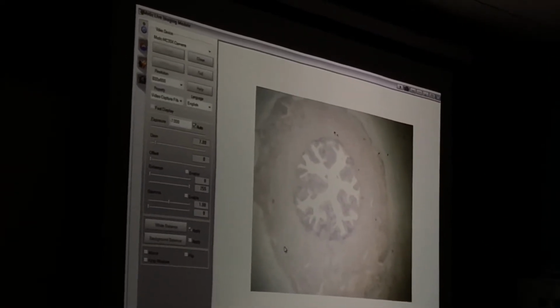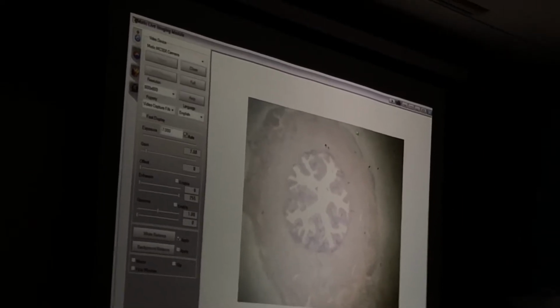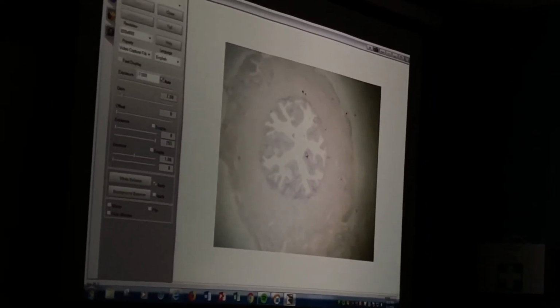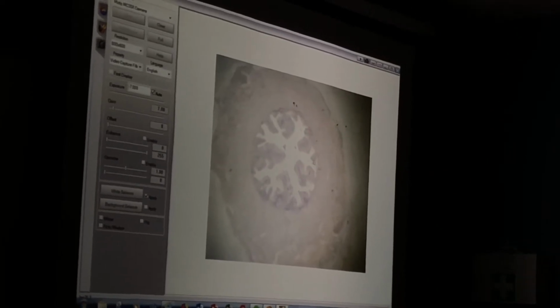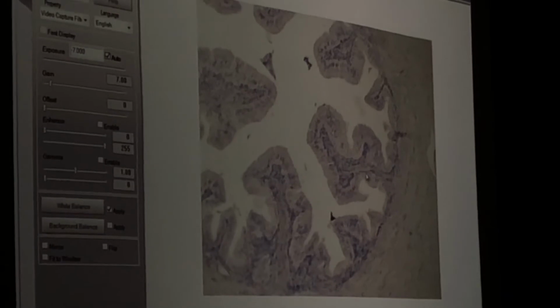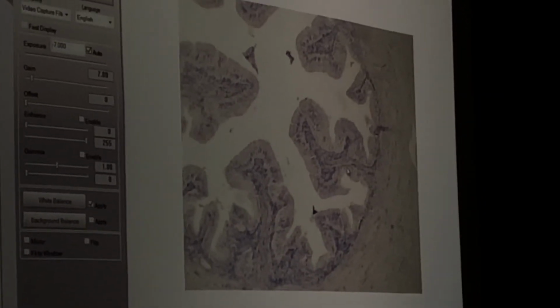What else do I see though? Smooth muscle. I see a lot of smooth muscle. Folds. Yeah, what are these called? Mucosal folds. Did anybody else have mucosal folds? No. So you want to make sure that you can tell a mucosal fold from a rugae, right? But when you bring them up to a little higher power, I think they really look different, don't you? More branch-like. Yeah.